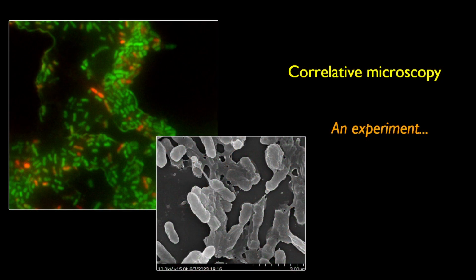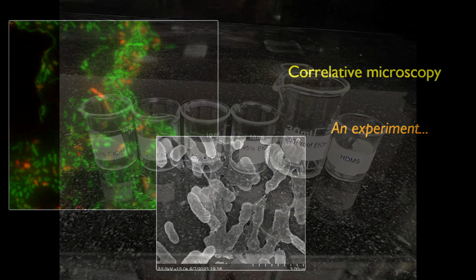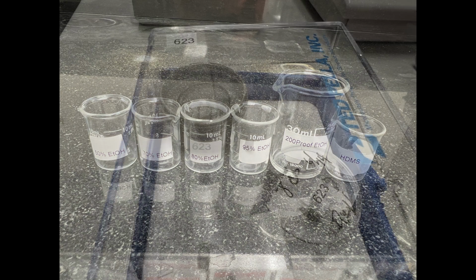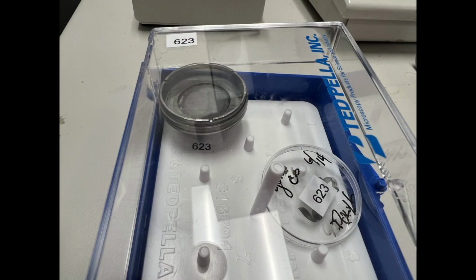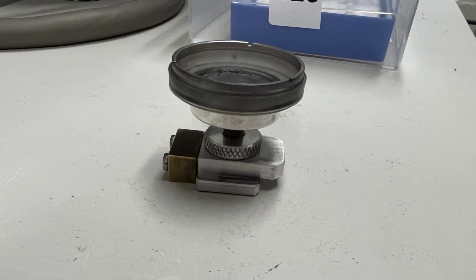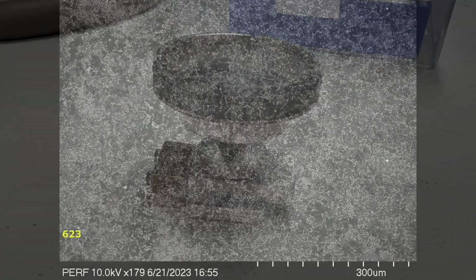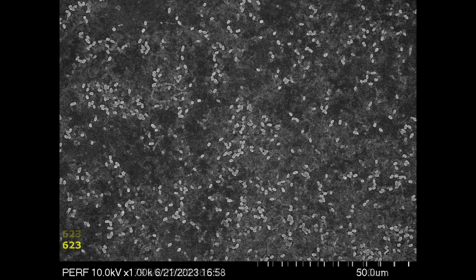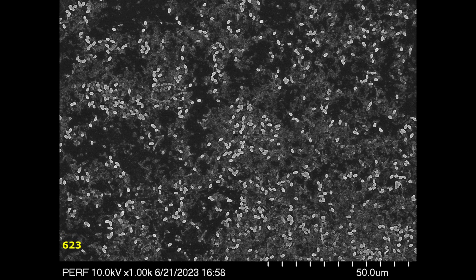So I had an idea. Since they're already in the culture dish, why not do some correlative microscopy and get some SEMs on exactly the same specimen? So what we did is I took the culture dish, went through the normal dehydration procedures for electron microscopy, and used some HMDS as well, sputter coated the culture dish, and then looked under the scanning electron microscope at exactly the same specimen I looked at under the fluorescent microscope.